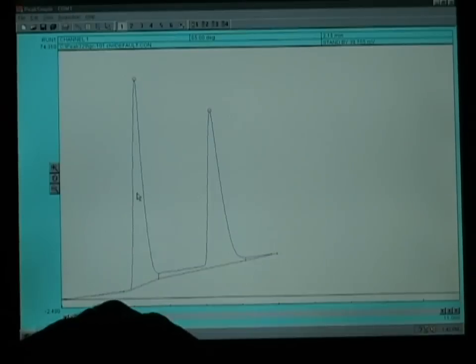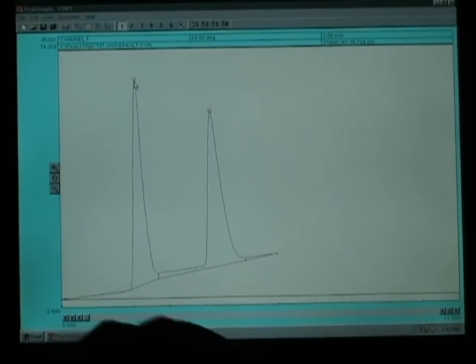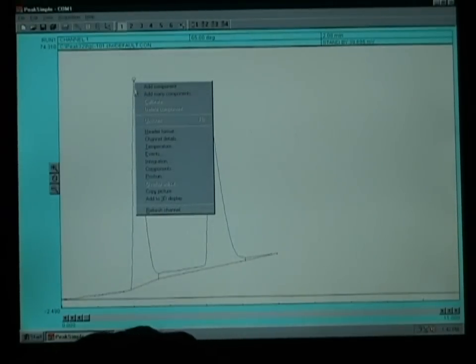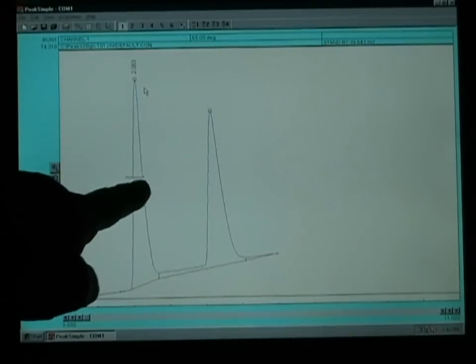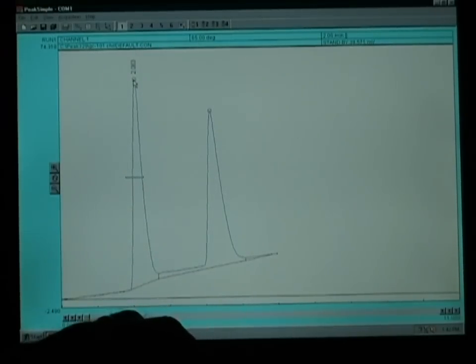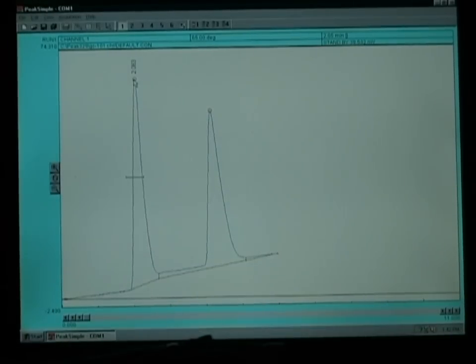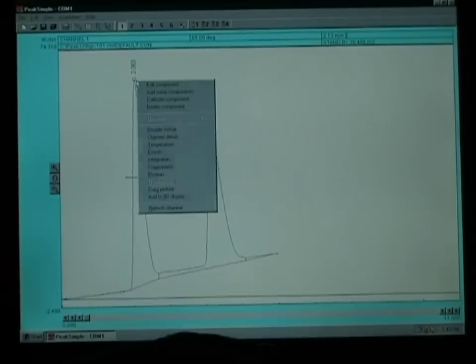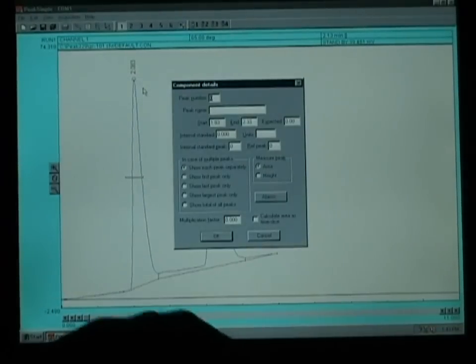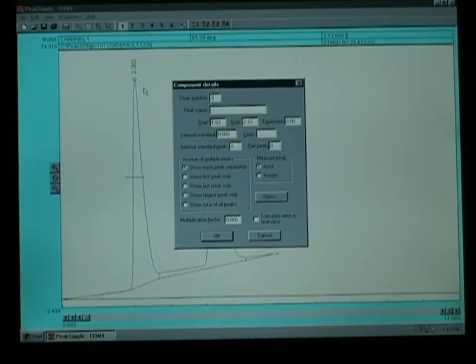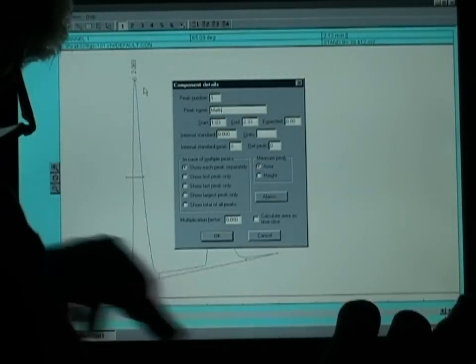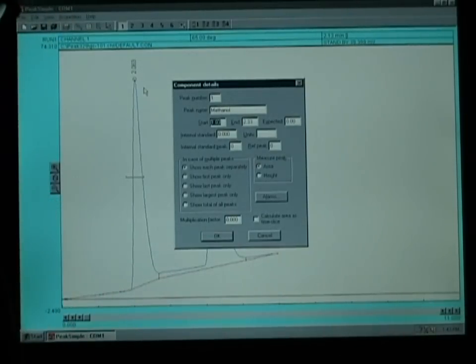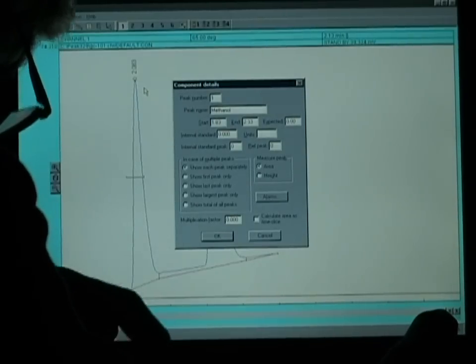To create our component file, we right click on the top of one of the circles and select Add Components and left click. You can see this will draw an integration bar that will allow us to define the identification of the material. Again we put the cursor on the top of the peak, right click again and select Edit Components and we go ahead and fill in our component table. So this is peak number one and the identification of this material is Methanol.